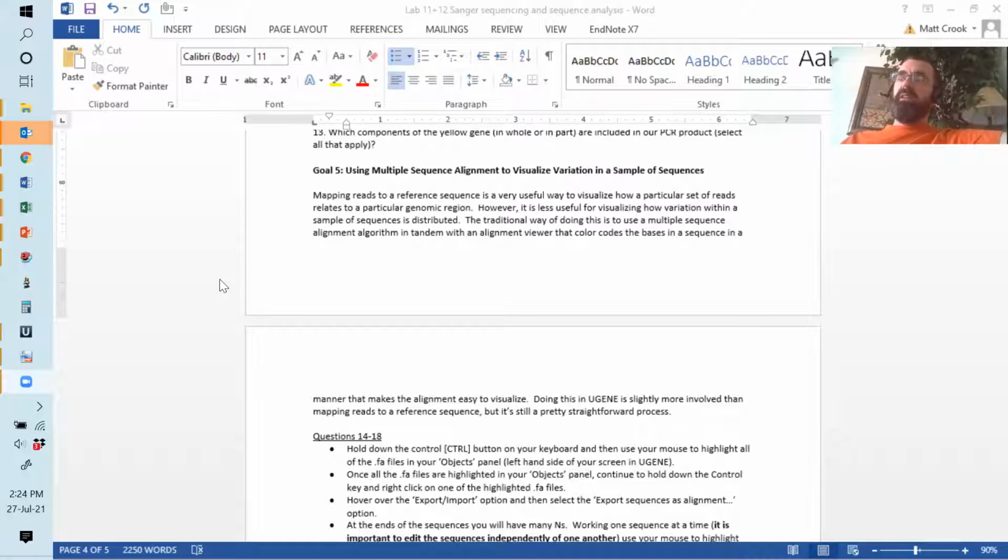Typically the bits that are similar or the same are the ones that are important, because they're shared amongst all versions of that. Going on from that, if you wish, you can use these alignments to build phylogenetic trees, trees showing the evolutionary relationship between species.